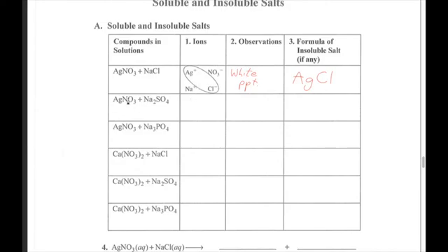We have our silver nitrate again. So just like over here, we have our silver ions, Ag+, and our nitrate ions, which are NO3-, which hopefully you memorize, but if not, that's okay. You can look that up and see that that's nitrate. Though if you know that silver is +1 and there's only nitrate, there's no parentheses around a number outside, you know that it must be a -1 to balance that out. So nitrate's NO3-, and it's going to be the same in all of these.